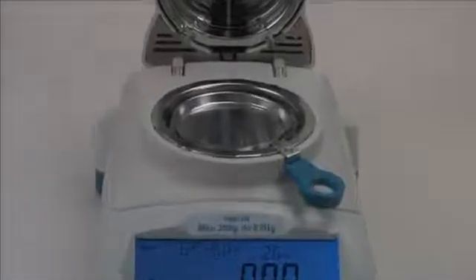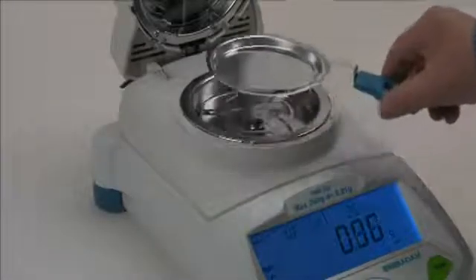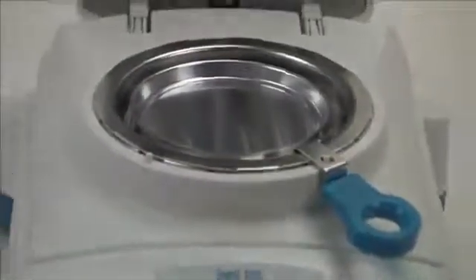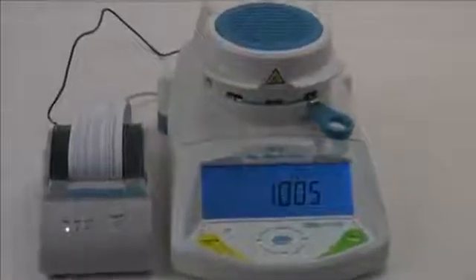Two Adam Moisture Analyzers offer the same features and operation for simple and fast moisture determination. The PMB 53 provides moisture content results to 0.01% with a maximum capacity of 50 grams. The PMB 202 delivers moisture content results to 0.05% with a maximum capacity of 200 grams.